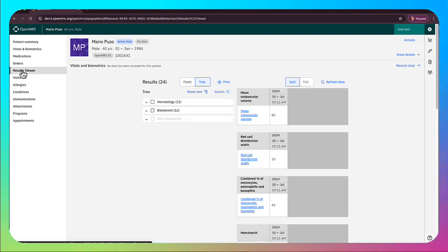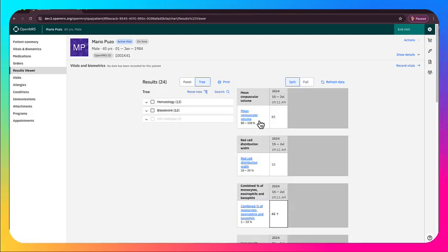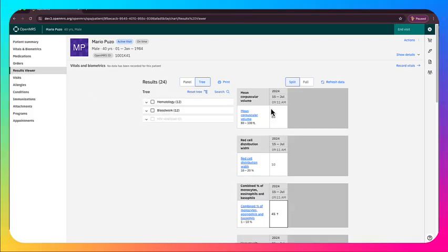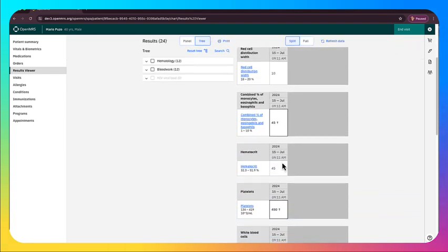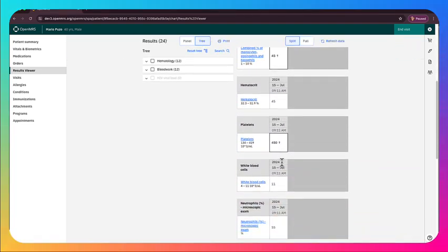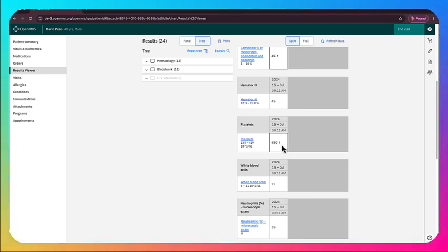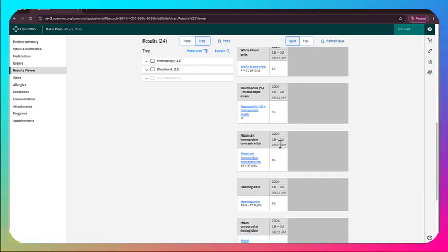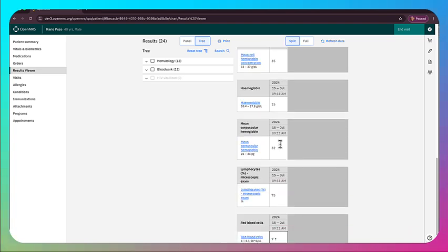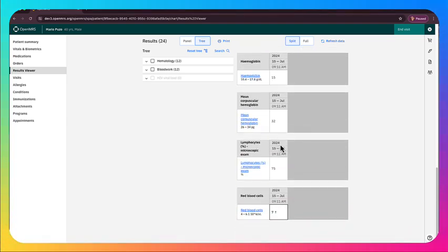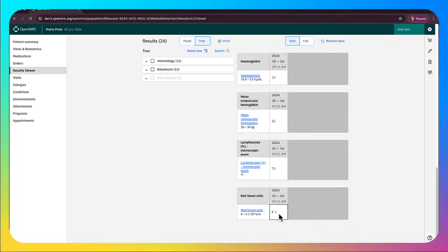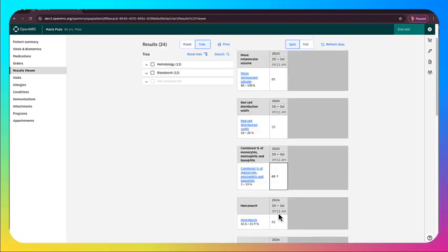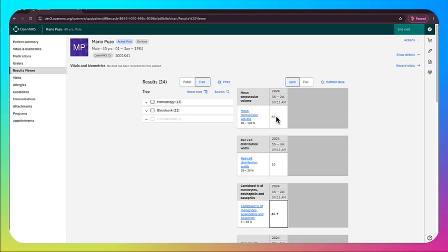And now we're at the results viewer. So within the results viewer, now we can see the results that we have just entered. You can see that they're both hematology and blood work. And you can see here that the platelets, the normal range goes up to 419, since that was 425, it was listed as elevated. Same thing here for these red blood cells.